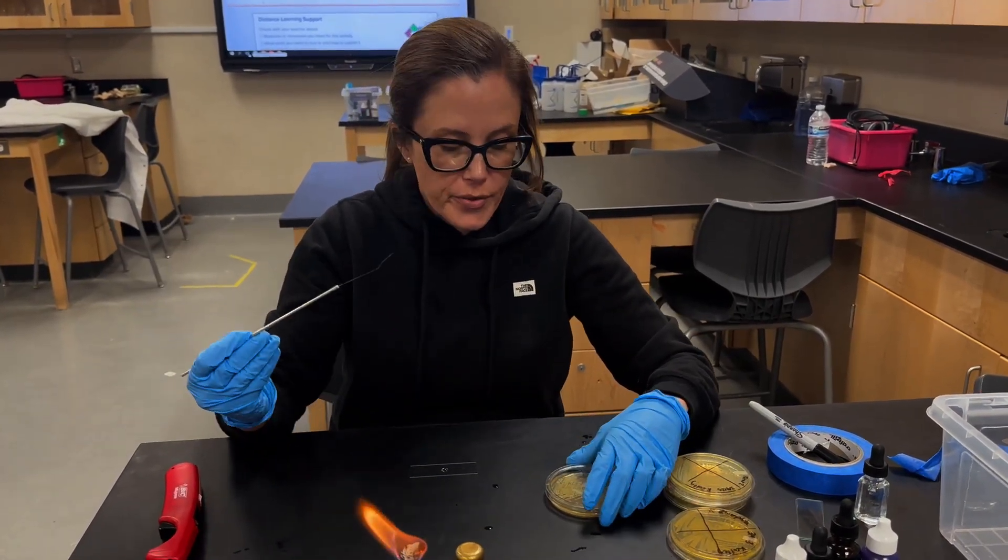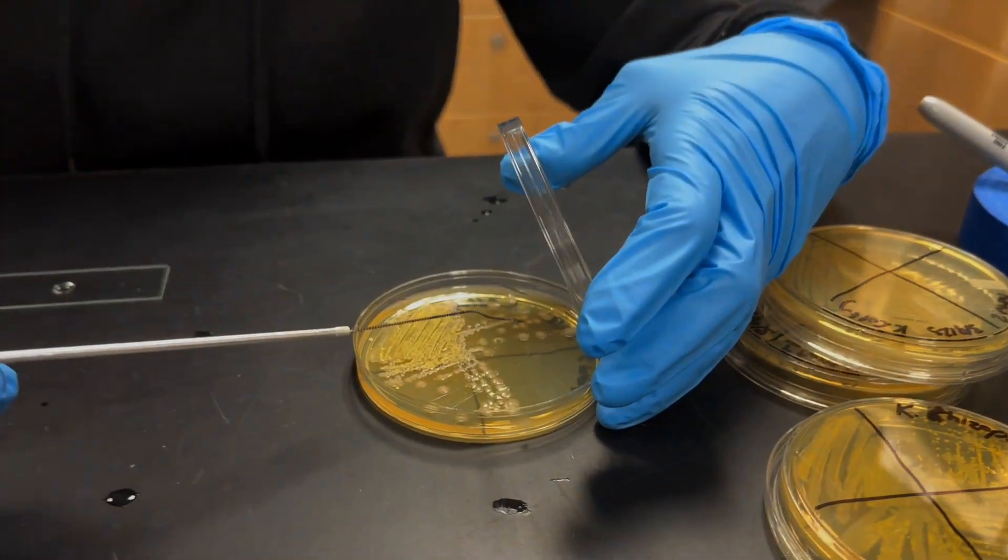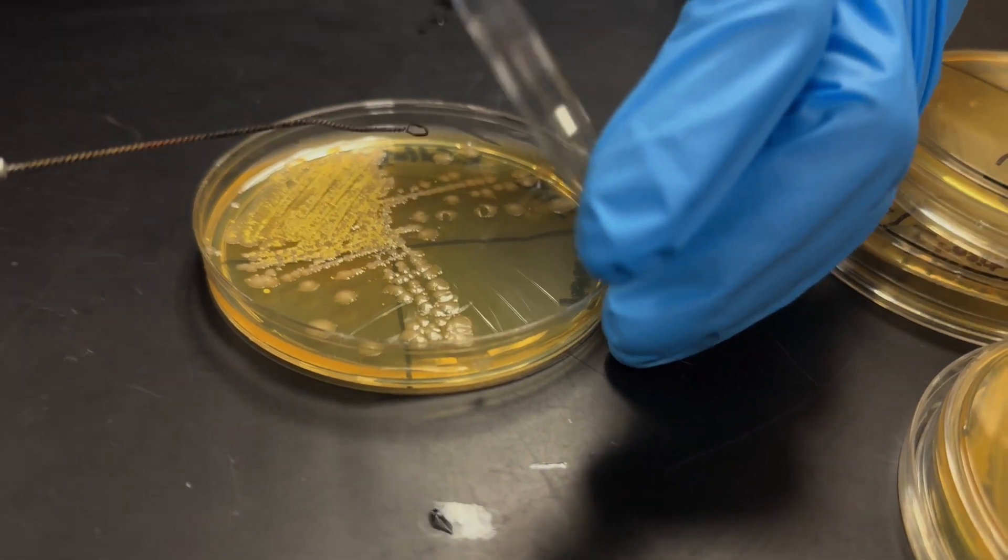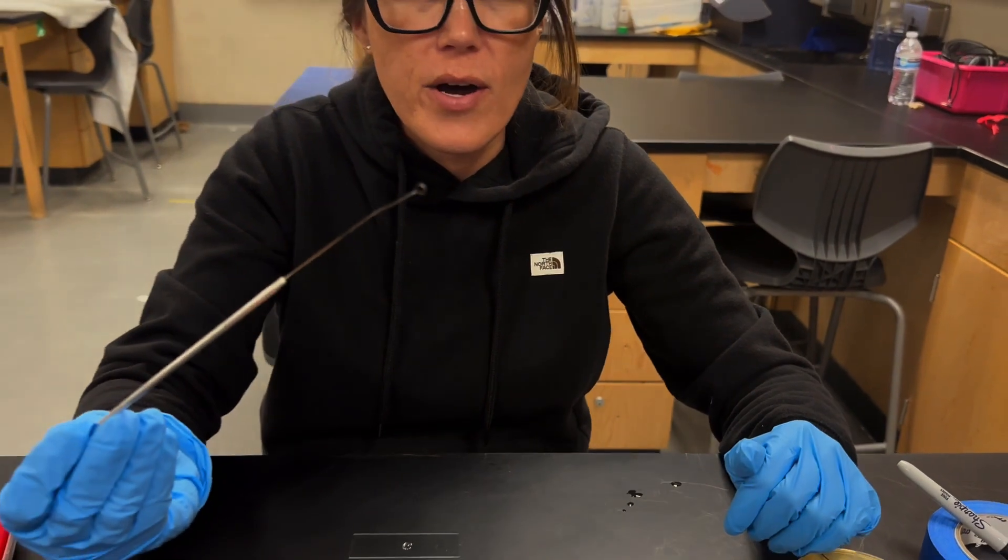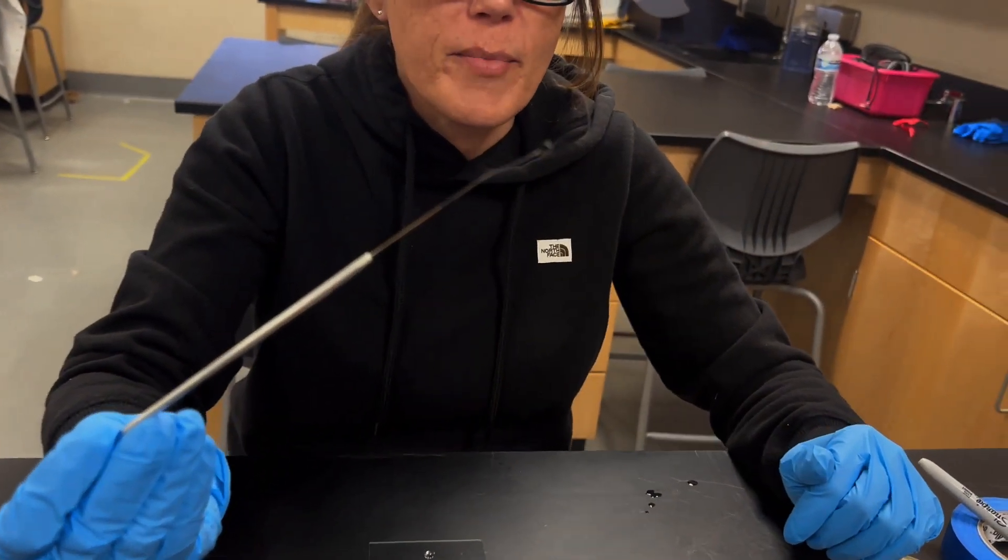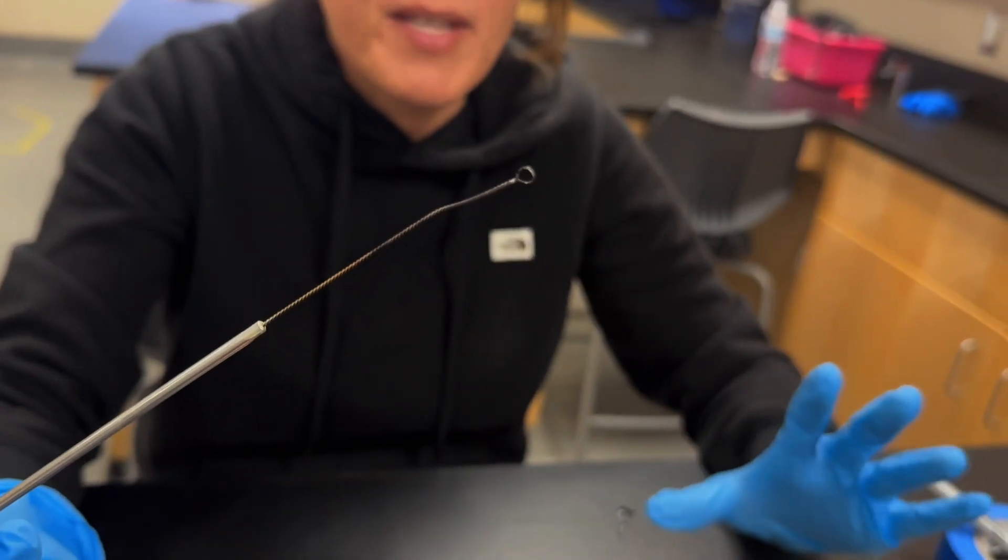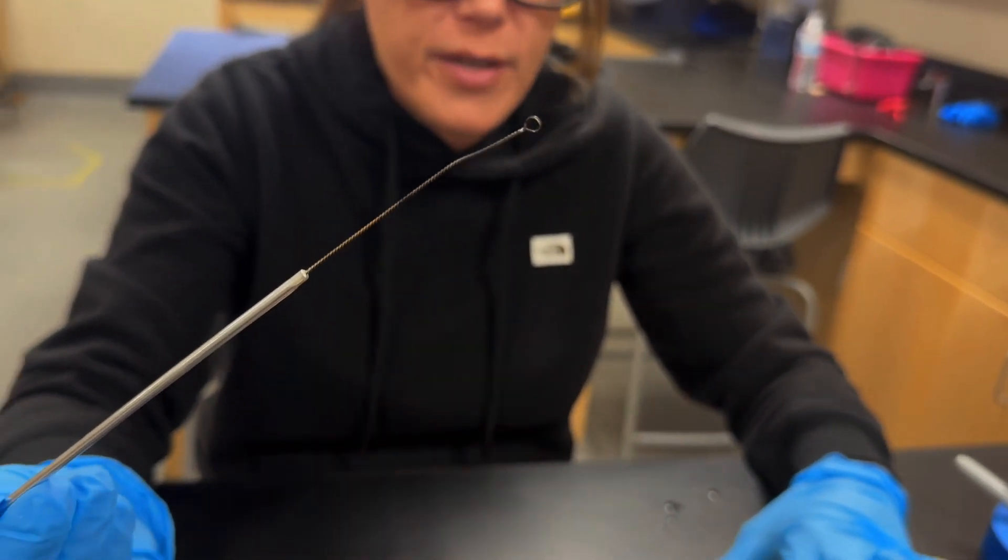So this is probably cool now. So we're going to go in and we're just going to touch this to one of the colonies. And it's important that you don't grab too much bacteria. You can see there's hardly anything on the loop. And remember this is microscopic. If it's too clumpy, it's going to be difficult for us to see under the microscope. So we just need to touch it to the bacterial sample.